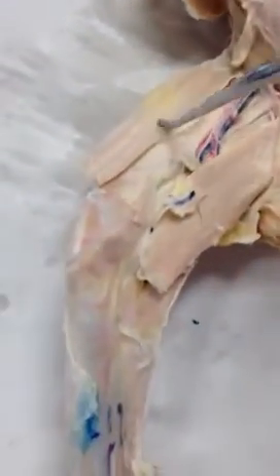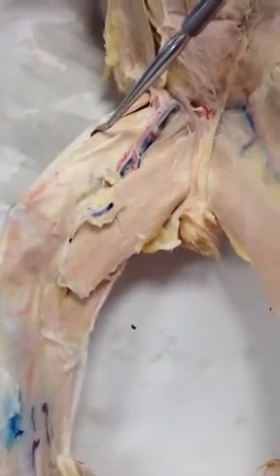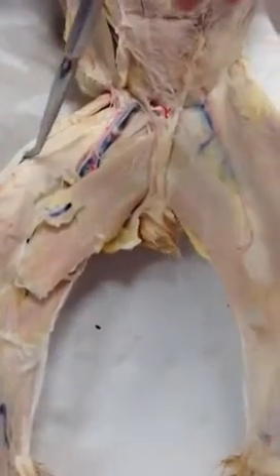And again, if I turn him over one more time, underneath the sartorius is the other connective tissue, and that is the fascia lata, and that's right here.